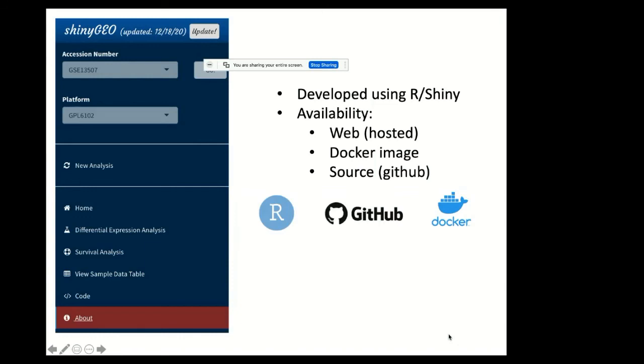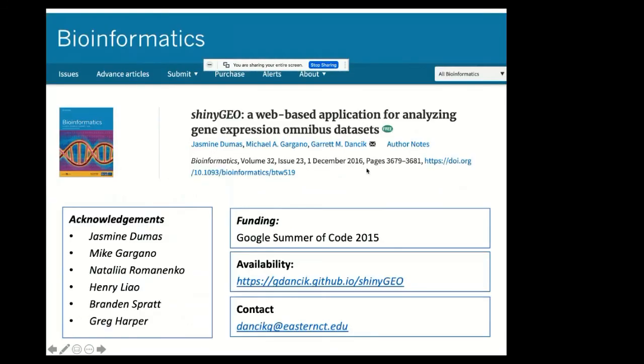The tool was developed using R and Shiny. Shiny is a framework for developing interactive web pages in R. The tool itself is available on a hosted website, so users don't need to download anything, they just go to the web page. But the tool is also available as a Docker image, and the source code is available on GitHub.